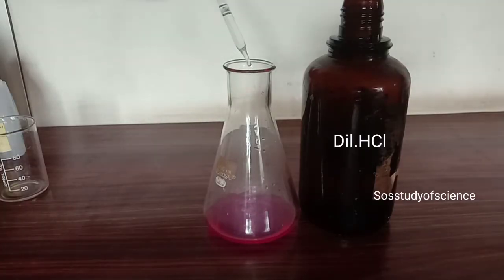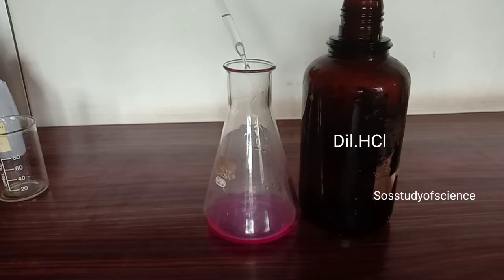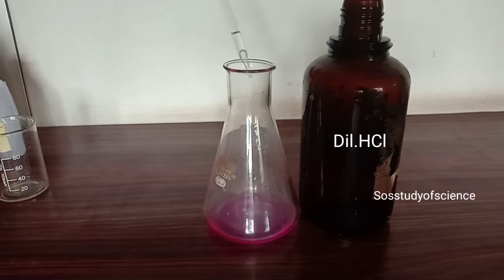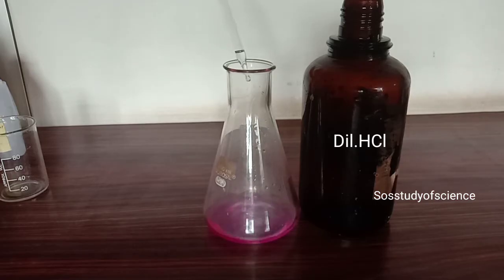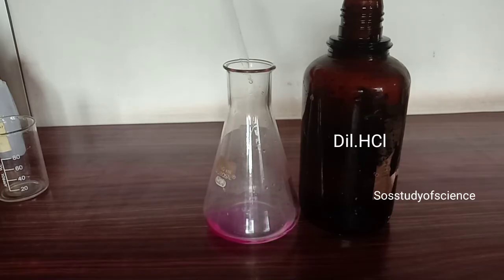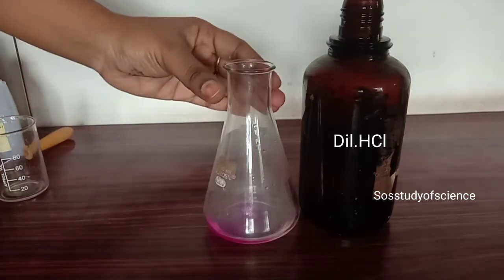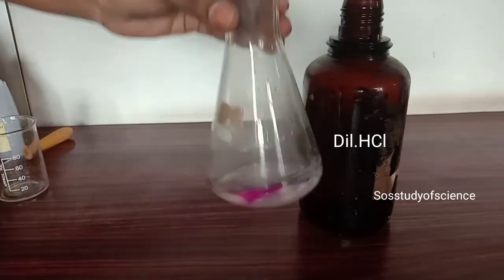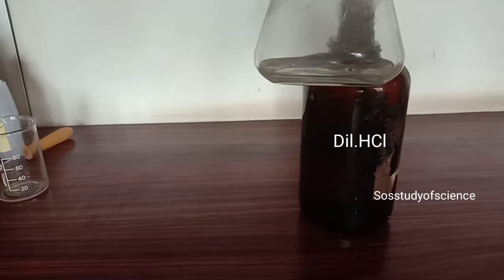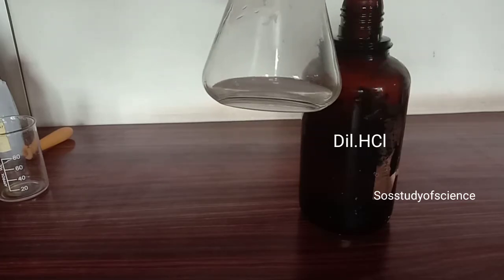Continue to add dilute hydrochloric acid to the solution. You can observe that at one certain point the pink color in the solution disappears. Take the conical flask and shake the solution once again. You can observe the pink color in the solution has completely disappeared.